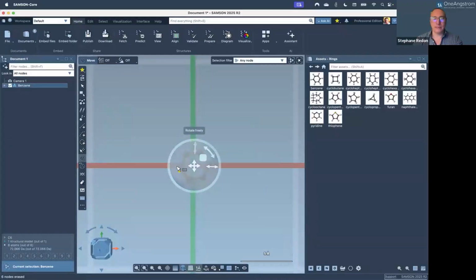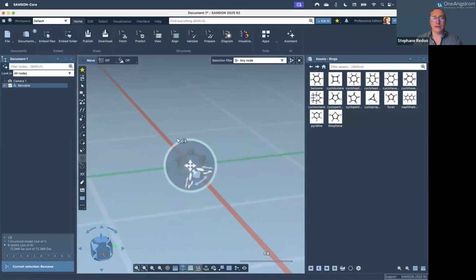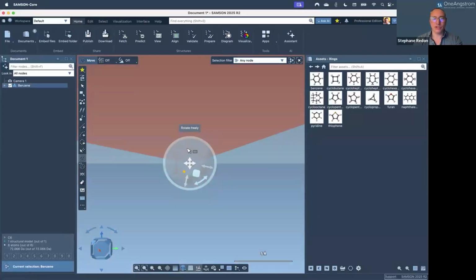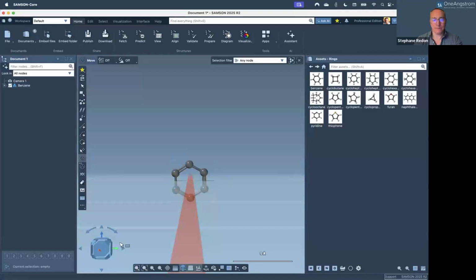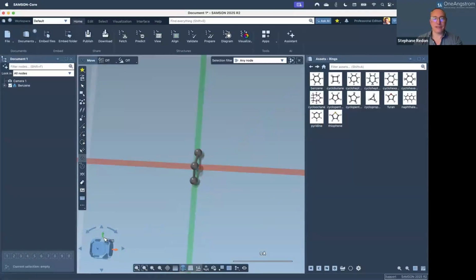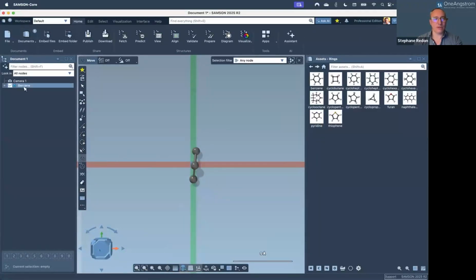Let's say I place it like this, rotate it a bit like this, and then from the side view here, I'm going to make sure that its borders, its sides would align. Okay. So let's say I have this ring now. Here it's not really well aligned.